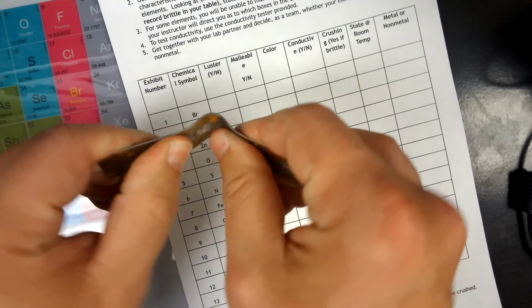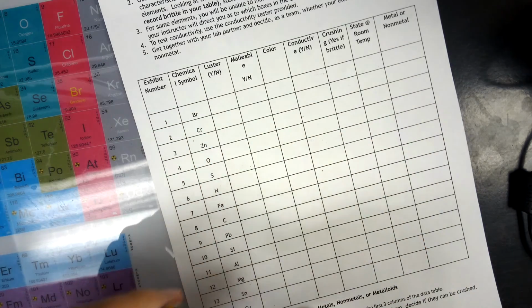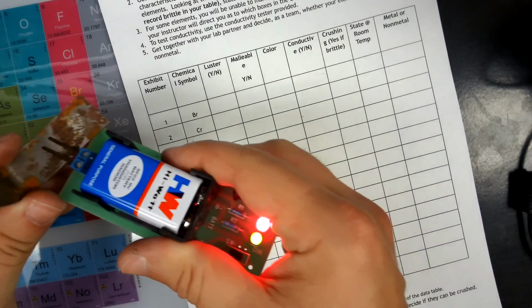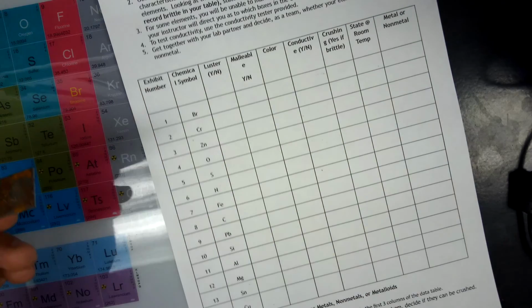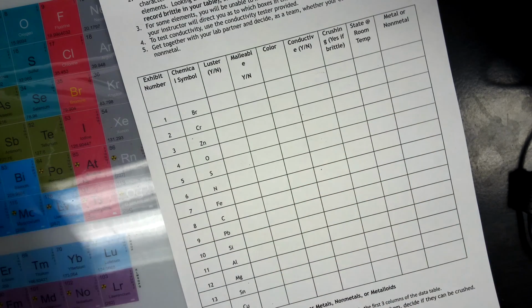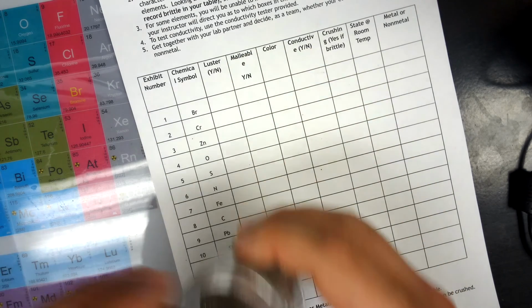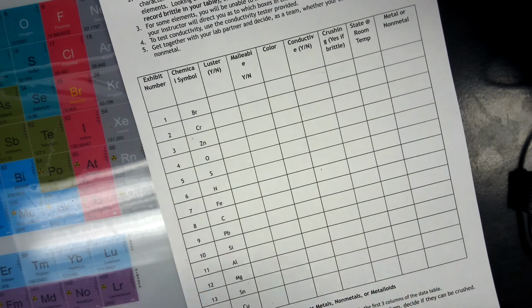So you can even bend a small piece like this. You can bend with your fingers. Silver in color. It is conductive. You can't crush it, and it is a solid. And then it comes in all sorts of different forms too, like here's some iron shavings, filings, and stuff like that.